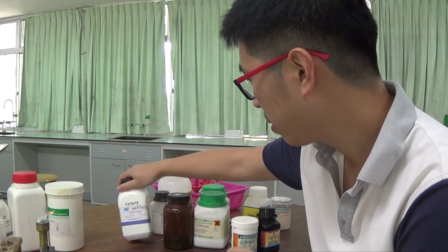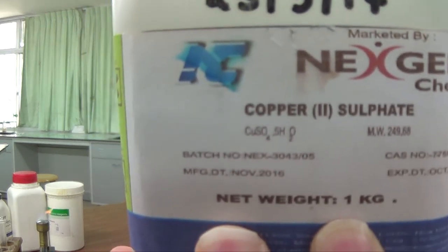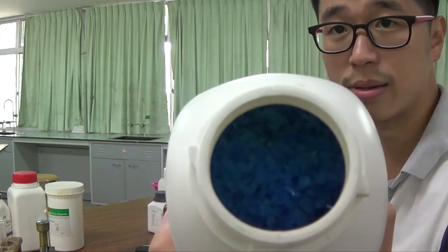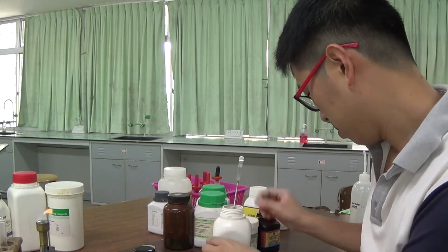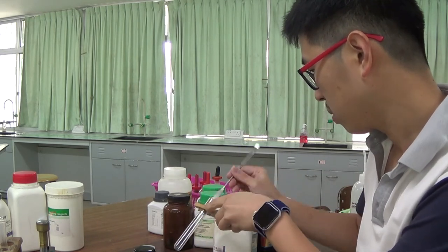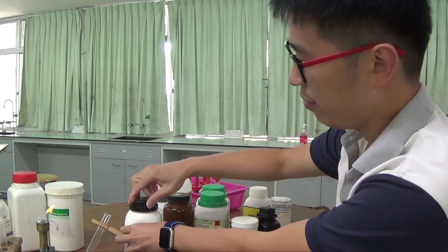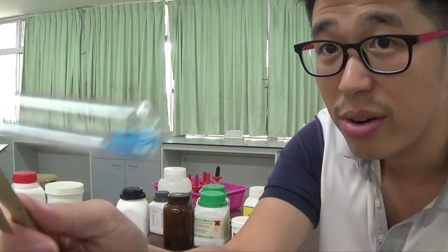I'll show you on copper 2 sulfate hydrated. This is copper 2 sulfate with 5H2O. So this is a blue colored solid, as I've shown you, very, very crystalline, like that. I will just take a little bit out. Really should have goggles and safety glasses and my lab coat. This is a blue colored solid, as you can see, very crystalline.